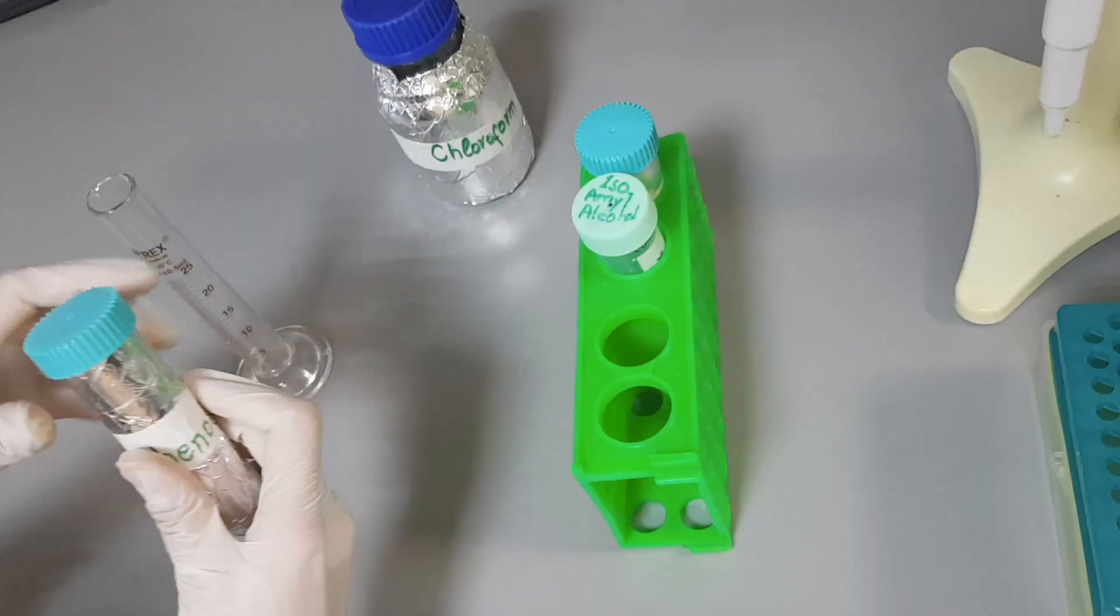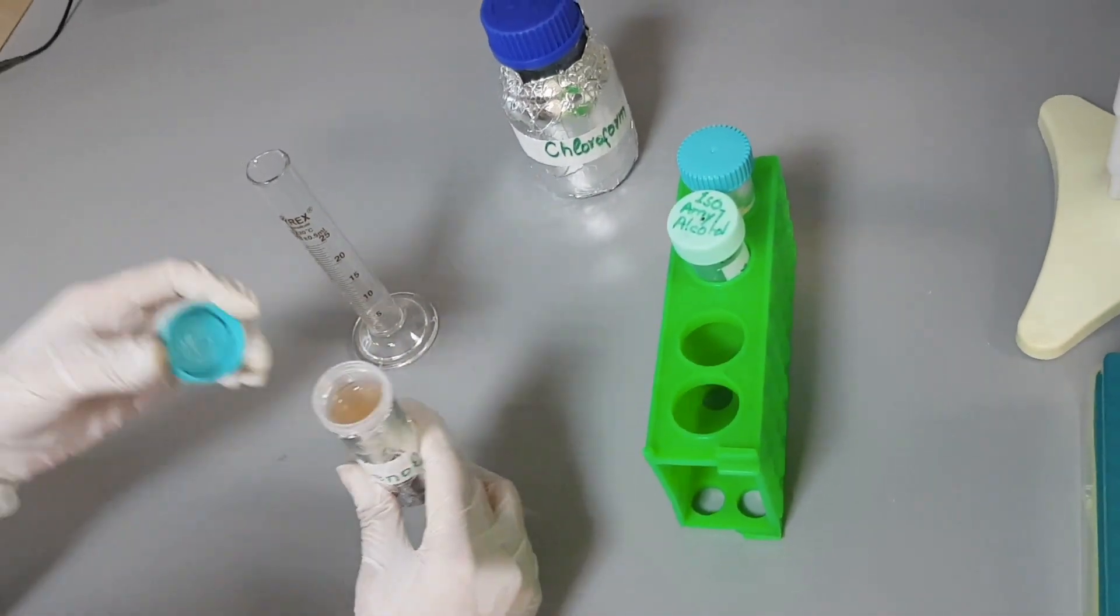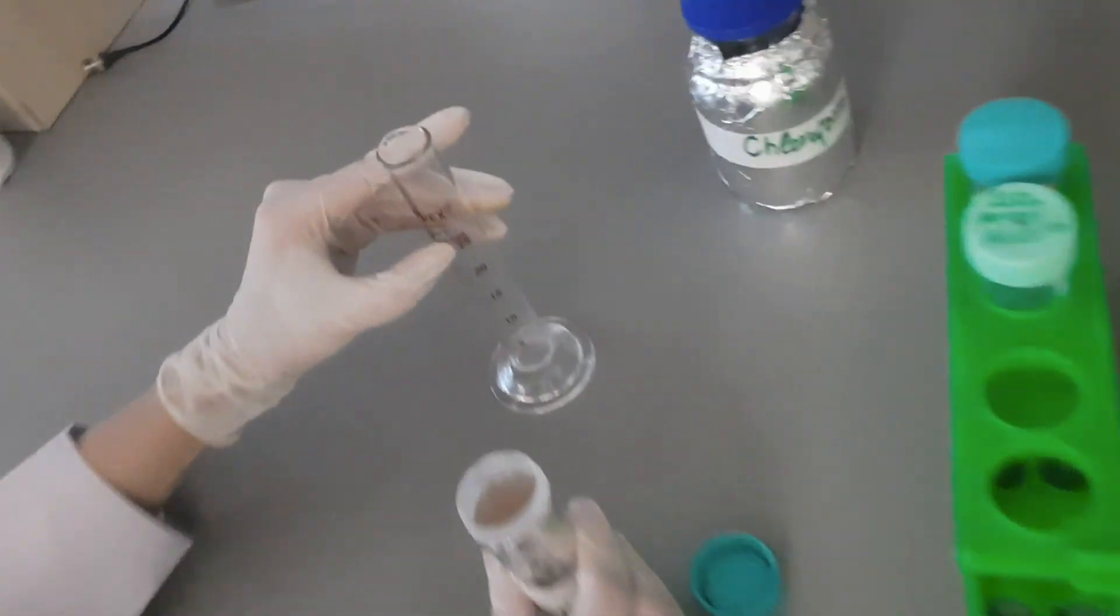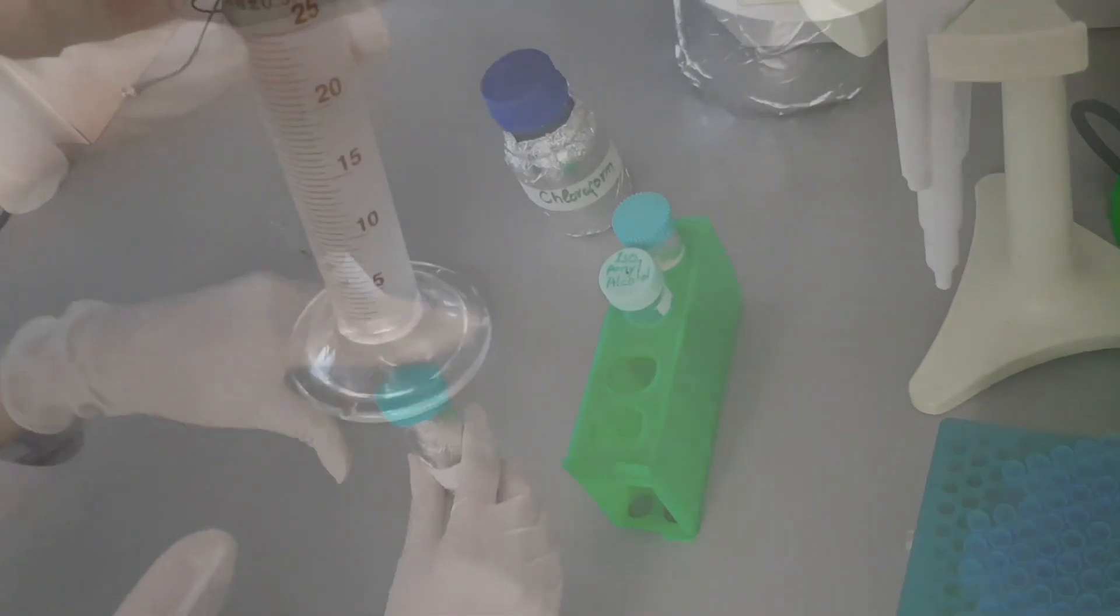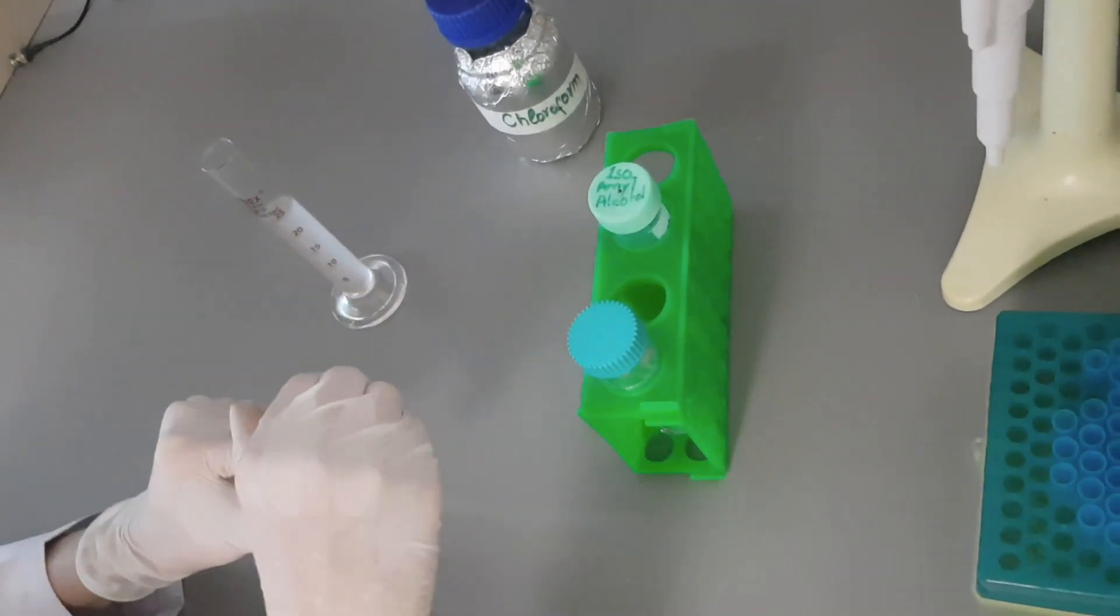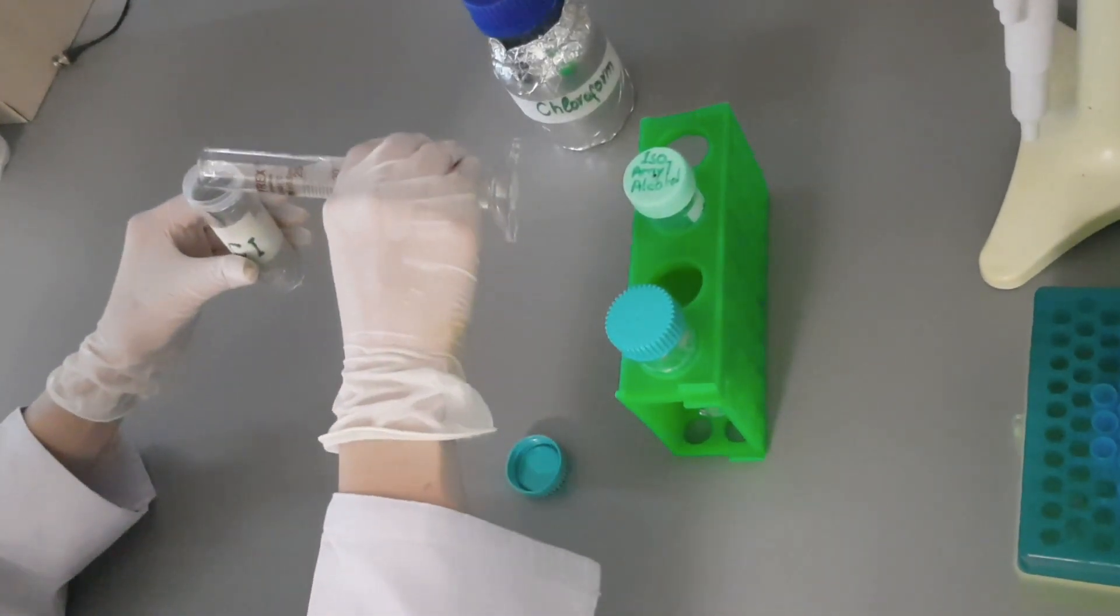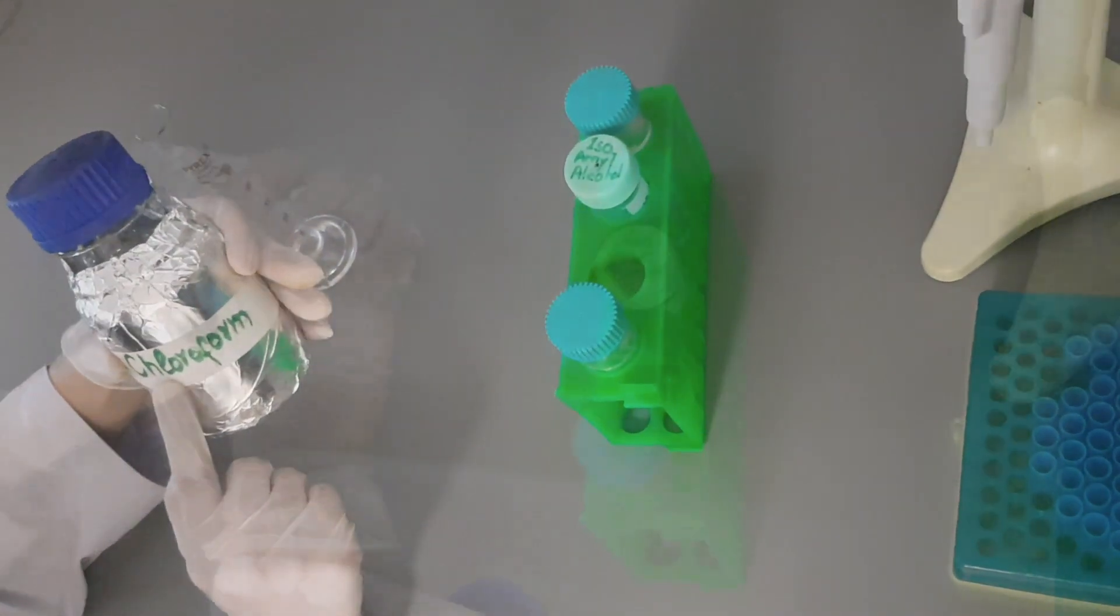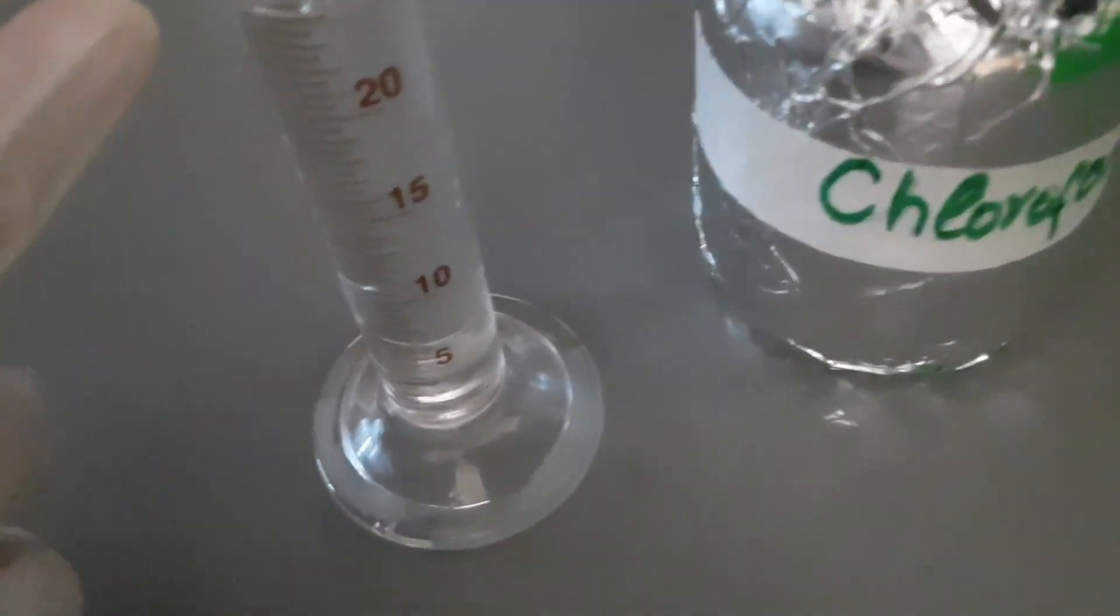For preparing 50 ml solution D, first switch the lights off as these reagents are light sensitive. Then measure 25 ml phenol by using a measuring cylinder and add in the falcon tube. Now measure 24 ml chloroform by using a measuring cylinder and add in 50 ml falcon tube.